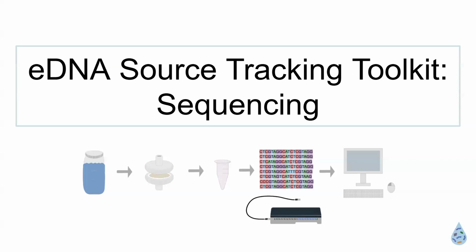Anything else? Yeah. So in the case that you had multiple samples from multiple sites where you needed the horizontal collection tubes, to sterilize them between samples, did you put all their equipment in a dilute bleach solution, or what does the sterility look like between sampling locations? I know that's something that some folks use, but there's a lot of controversy around that, so that's why I'm asking.